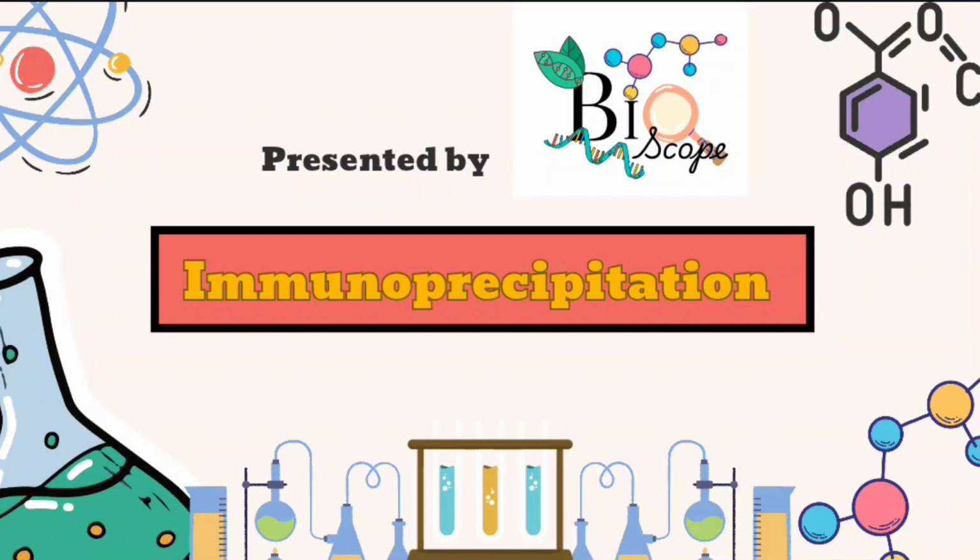Today we are diving into the fascinating world of immunoprecipitation, a powerful laboratory technique that uses the precision of antibodies to fish out specific proteins from a complex soup of molecules. In the next few minutes, you will see how we break open cells, let antibodies find their perfect match, and then pull those proteins out for study. Whether it's protein-protein interaction, disease research, or mapping DNA binding sites, this technique is a game changer in the field of molecular biology.